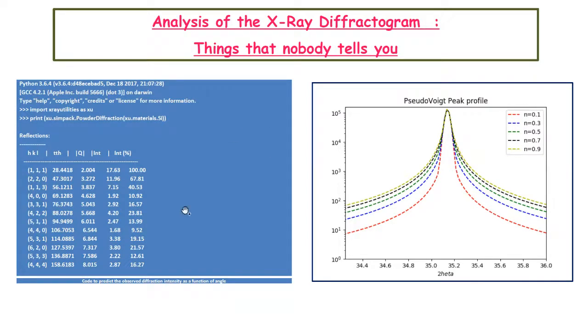So I had Rajesh who was always talking about XRD, and we have been dealing with open source resources, so I tried to look up the application of Python for XRD. And as I said, it allows you various analysis tools and techniques to understand the underlying thing. So if you come and tell me that I'm going to have a particular material, can I know beforehand what my spectrum is going to be like? And yes, indeed, it is possible.